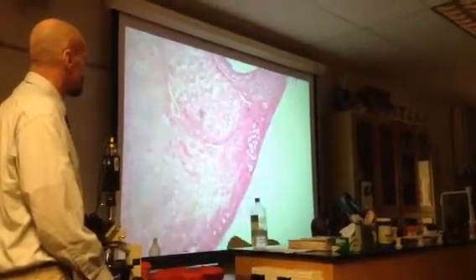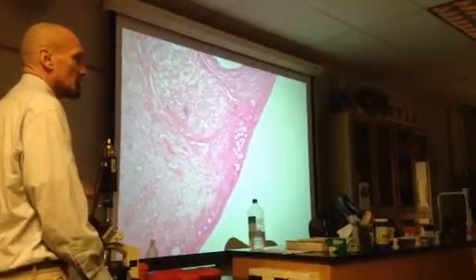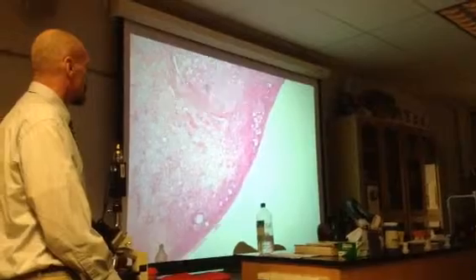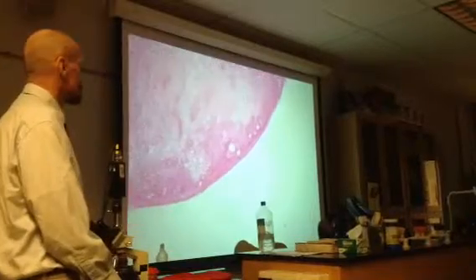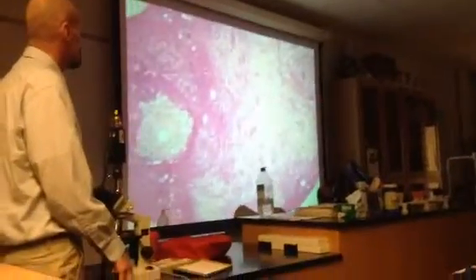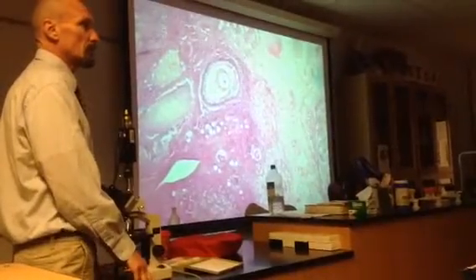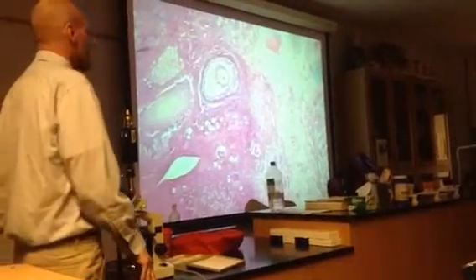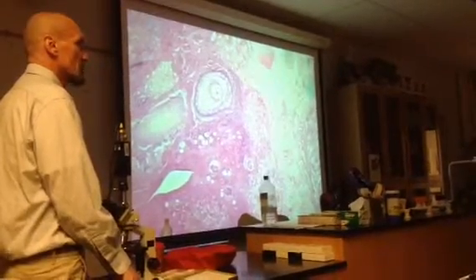What about these guys in the periphery? Primary, or possibly primordial follicles, they're still primary oocytes at that point. Females actually begin meiosis before they're born. We'll talk about that in the lecture. But it just gets put on a dormant stage. And in here there's a pretty good secondary follicle, and that's one right there. That's a pretty good example of a fairly late stage secondary follicle. Maybe a cycle or two, it keeps getting stimulated by FSH and LH, turns into a Graafian follicle.